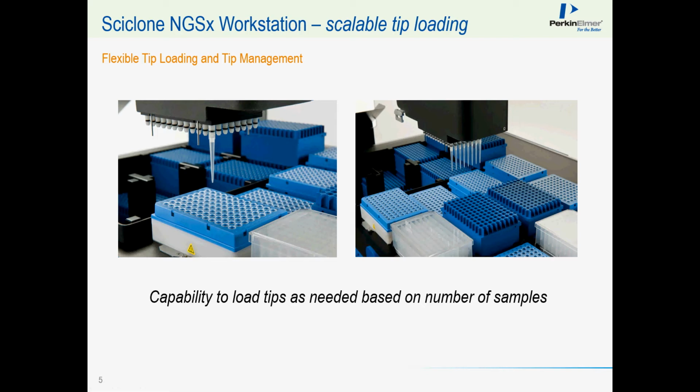The head has the ability to pick up a single tip as well, based off of the tip box design. You may notice in the right picture that the edges of this tip box are scalloped on the side. This tip box design was made on purpose so that if you did need to load a single column of tips or a single tip, for example for indexing or barcode broadcast, you can pick up a single tip, aspirate the index adapter of choice, and then distribute them to various wells.